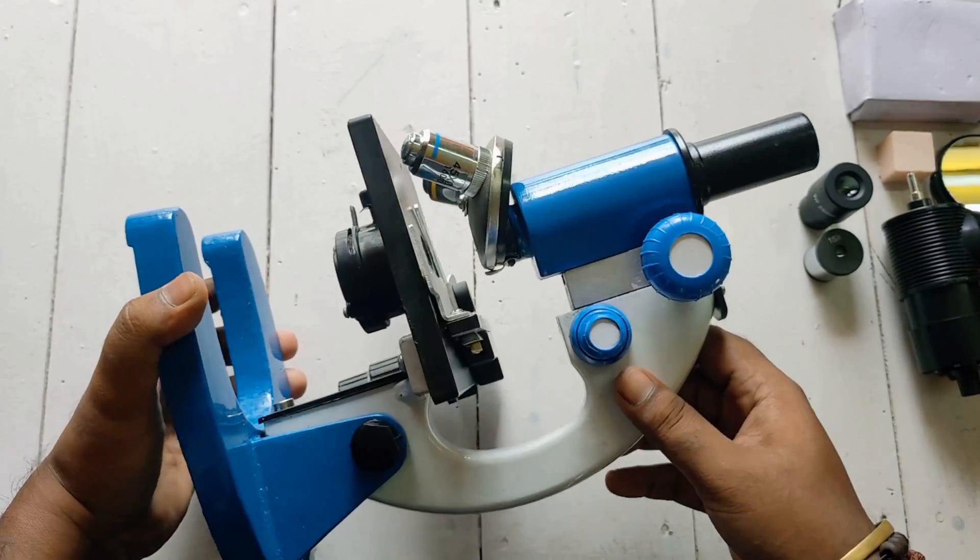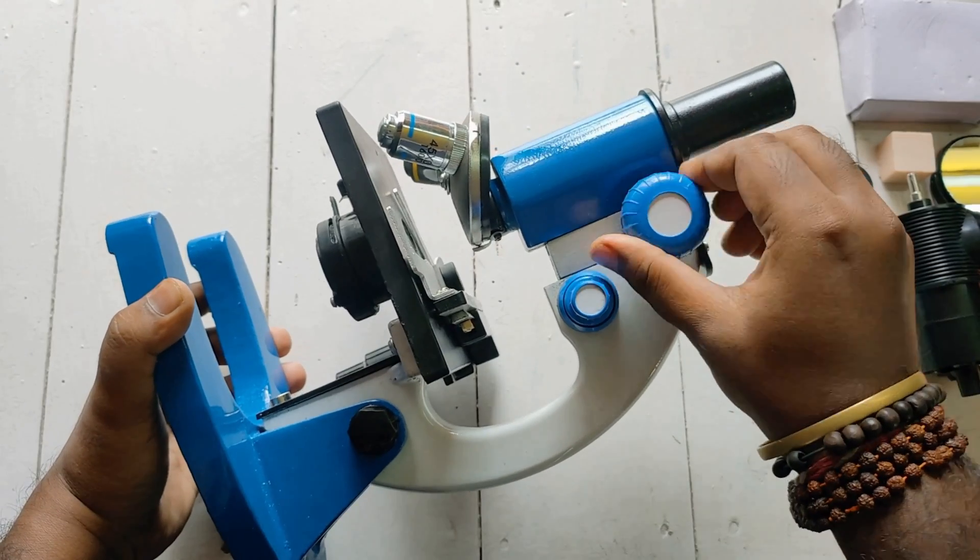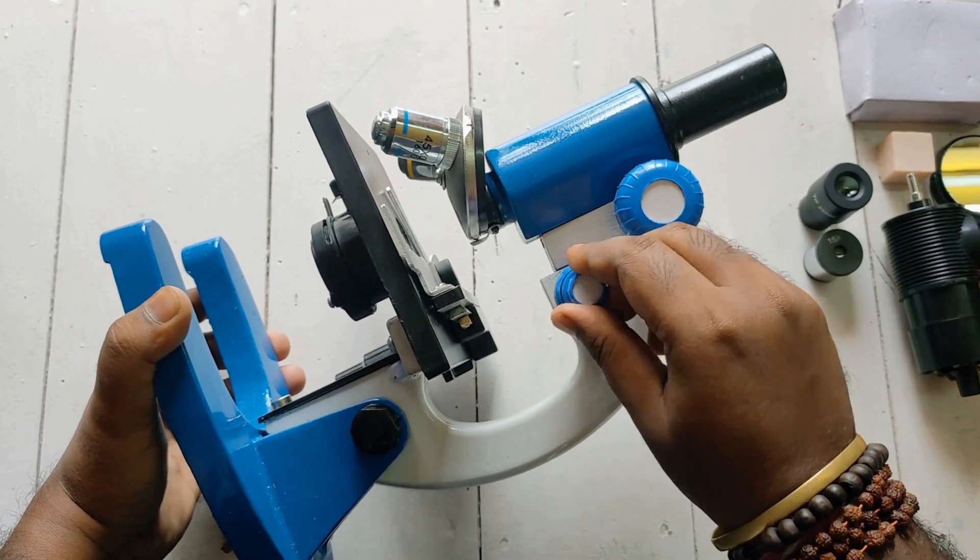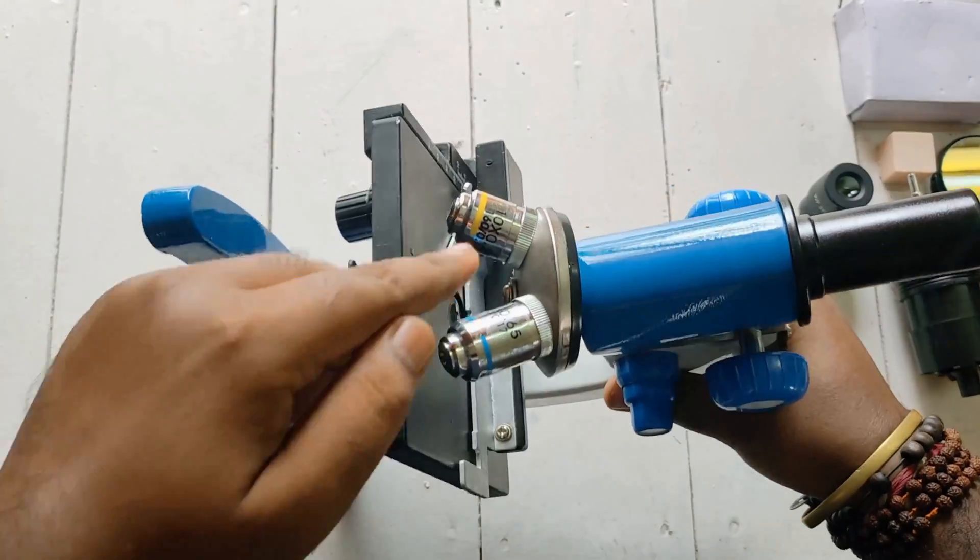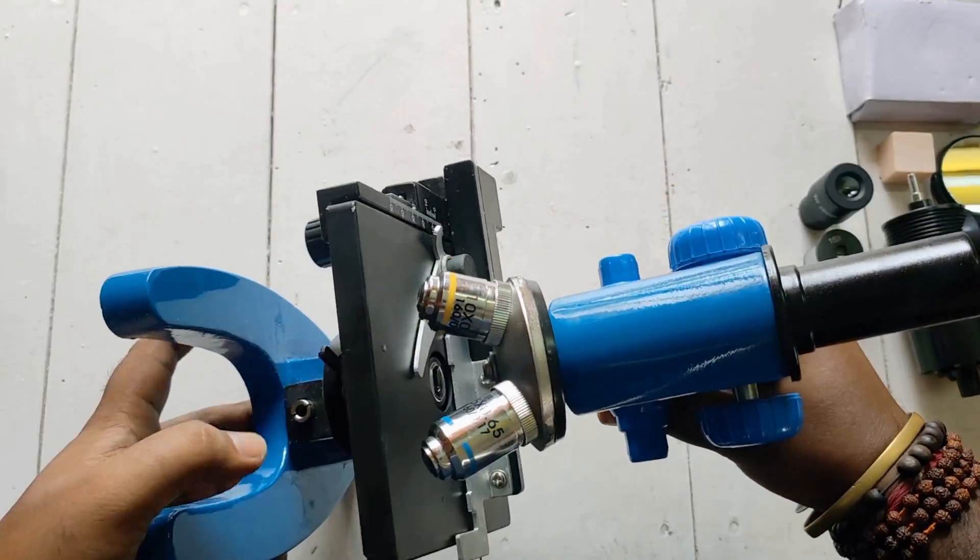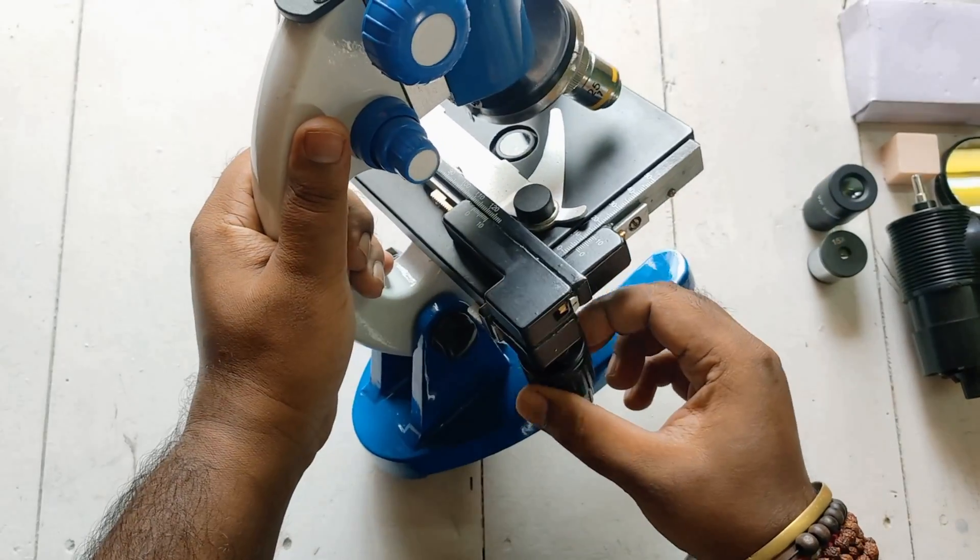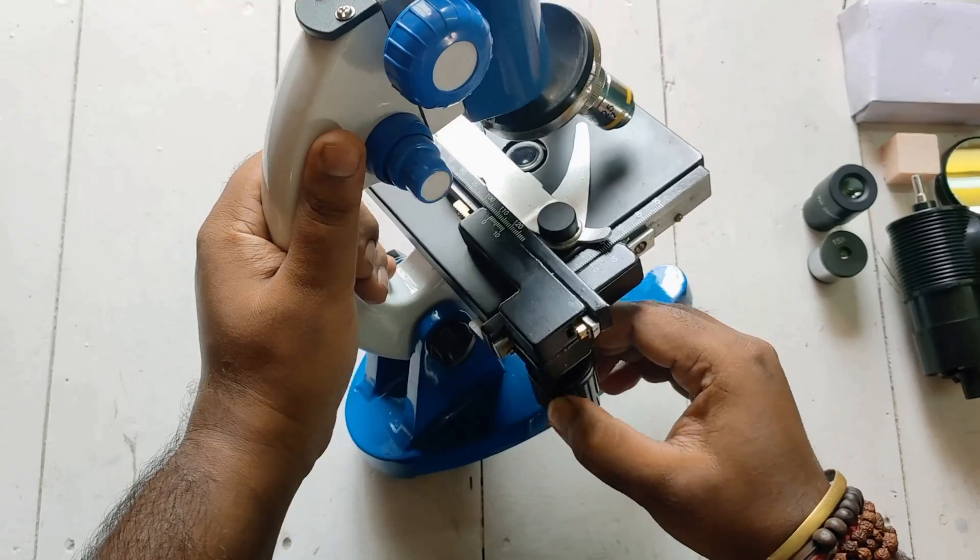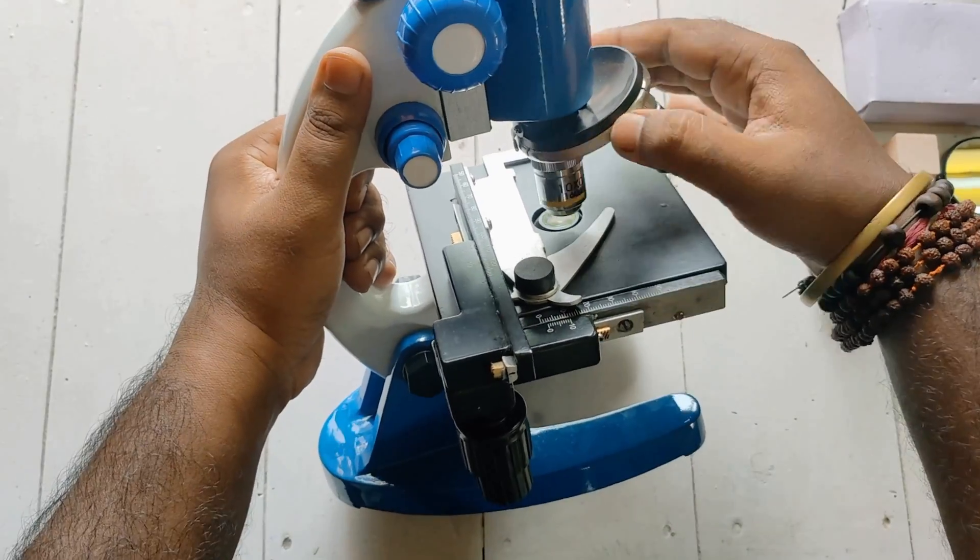Hope you all know about the microscope parts like this coarse adjustment knob, fine adjustment knob, condenser, stage, objective lens with 10x and 45x zoom, slide adjustment panel with moving knobs up-down and left-right. Here is the revolving nosepiece.